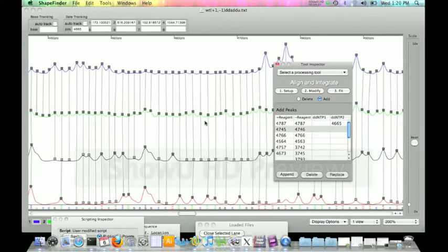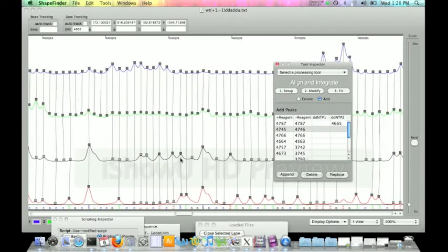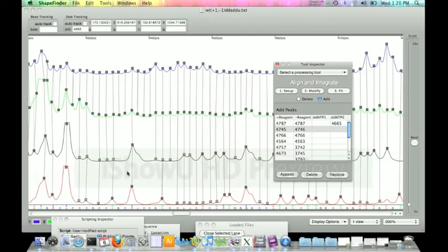So what you're looking at now is we can see in our DDA ladder we have our U's, 2 U's, a U, a U. We have our A in here, so it seems like it's still pretty well lined up in here. Alright, we're going through. And here's a spot where it's kind of tricky.